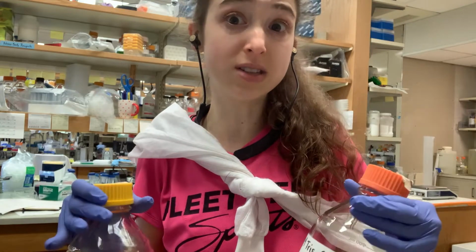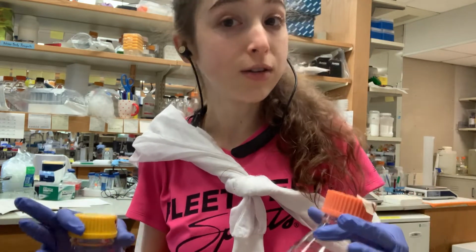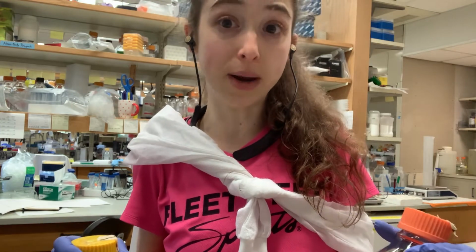So today I wanted to tell you more about why you might want to choose different buffers for different experiments, how you choose a buffer, as well as how you prepare the buffers. There are heaps of buffers. We're talking HEPES, Tris, MOPS, CHAPS, PIPES. I can't even remember all the different names, but there's a lot of different buffers. But you can narrow things down, and you can start narrowing things down by finding a buffer that has a pKa that is near the pH that you want, so that you're in the buffering zone.